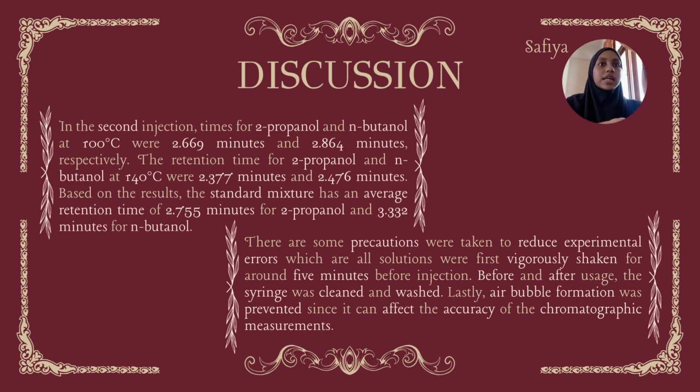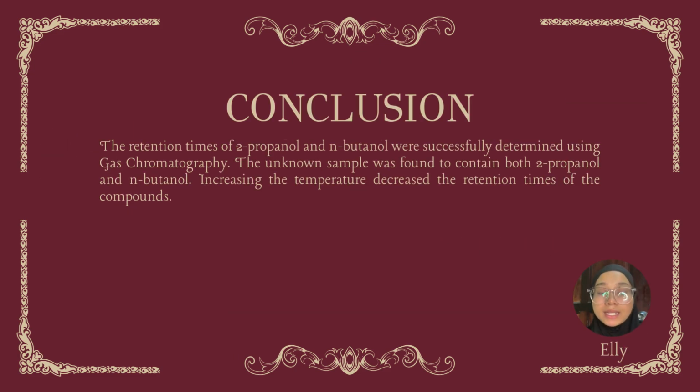Based on the results, the standard mixture has an average retention time of 2.755 minutes for 2-propanol and 3.332 minutes for N-butanol. The retention times of 2-propanol and N-butanol were successfully determined using gas chromatography. The unknown sample was found to contain both 2-propanol and N-butanol. Increasing the temperature decreased the retention time of the compounds.